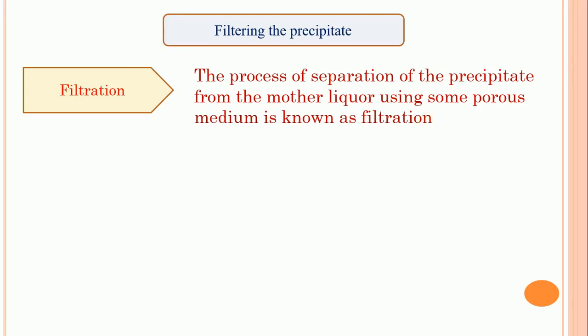It is only the separation of the precipitate from the solvent, from the mother liquor from which it is prepared. So that is a simple method, known as filtration.